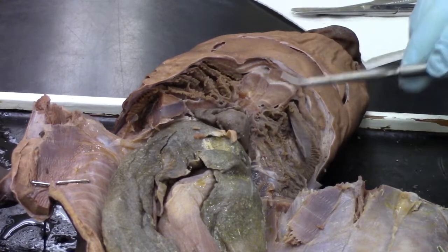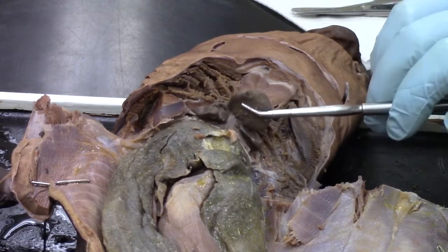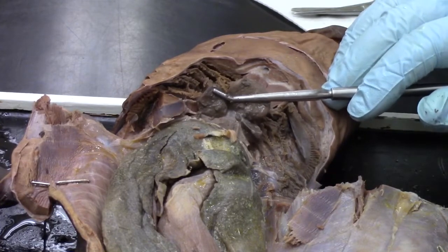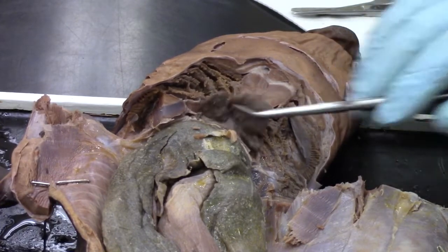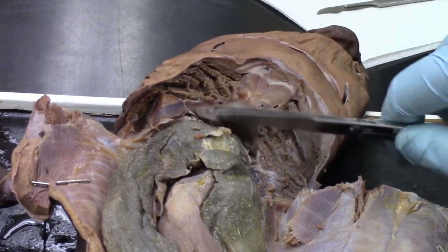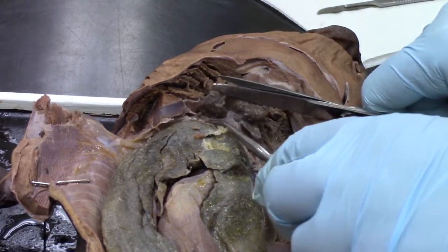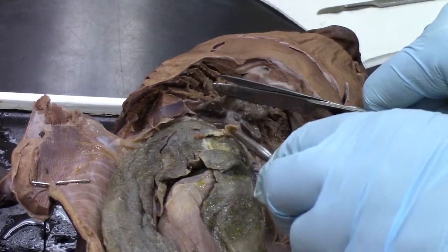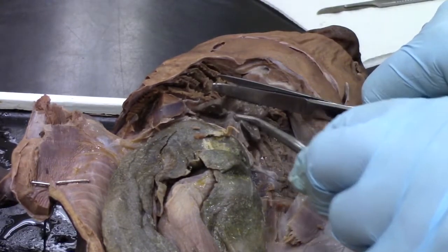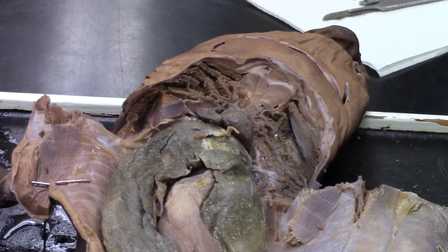And then this is a hard one for me to show you on video, but we have a great photo of it. If I lift the heart up here with a pair of scissors, we can see I actually cut into it a little bit, but we have what's known as the sinus venosus. So I can see I've cut it on the one edge here. So these are the 4 parts of the shark's heart.